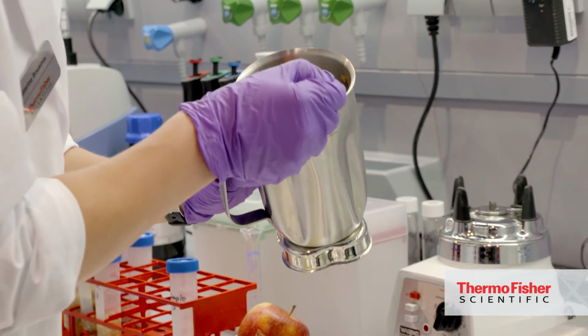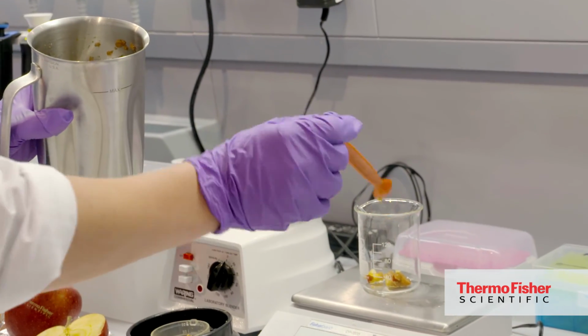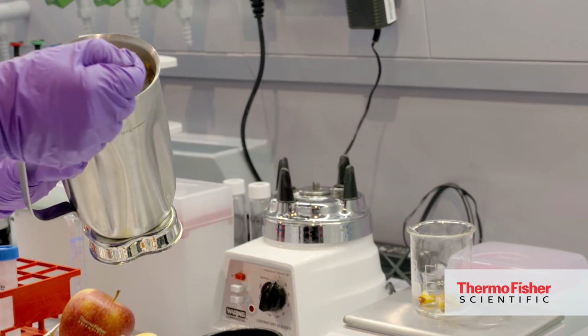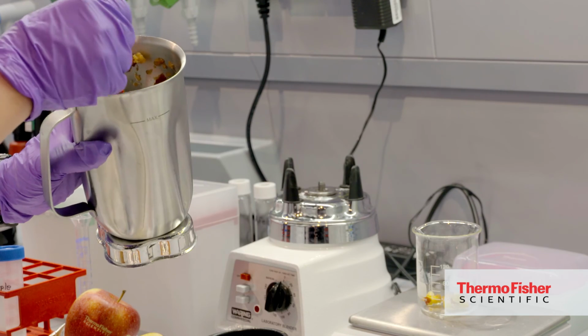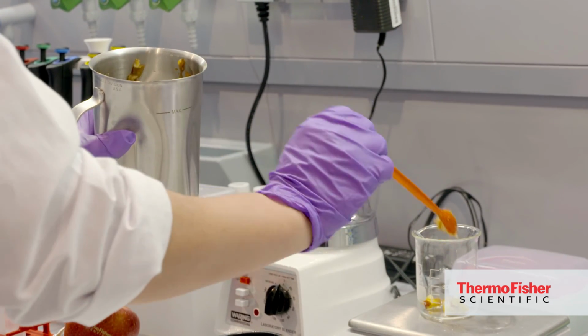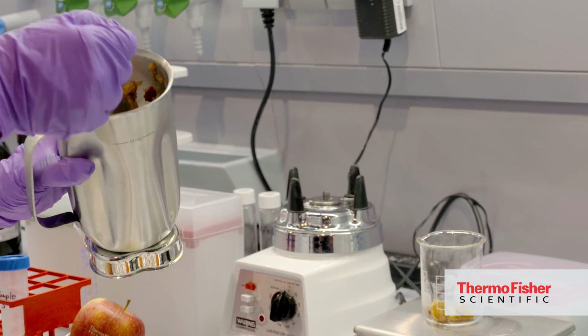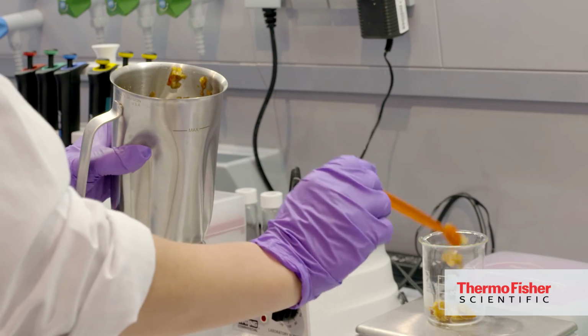So we have two options. Either we do the sample preparation with the classic QuEChERS method, but what we demonstrate this time is using the accelerated solvent extractor-based method. First of all, we need a given number of sample weight. This is what is ongoing.